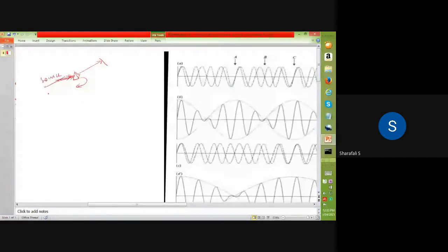Then that hits this prism, and that prism will make some dispersion effect, and individual frequencies are coming out from this prism at a different angle, and correspondingly we can rotate that prism in such a way that we get different frequency at different angle, and these frequencies are used by this IR spectrometer. This is just a representation. This is not the actual IR spectrometer. And that will be going to your sample. For example, if this is your sample, then from that it will be detected by using your detector.